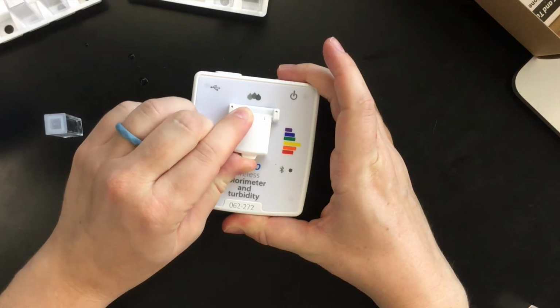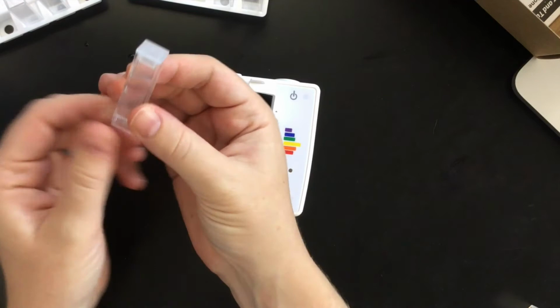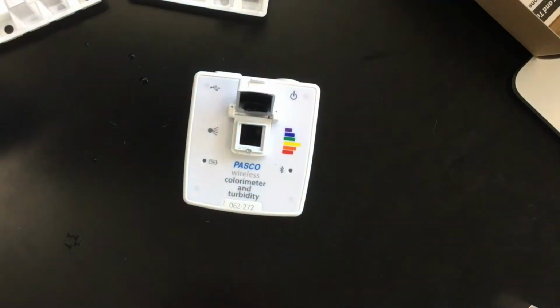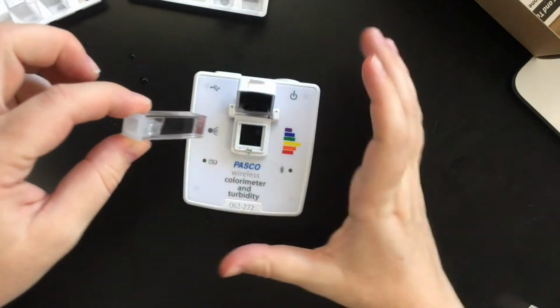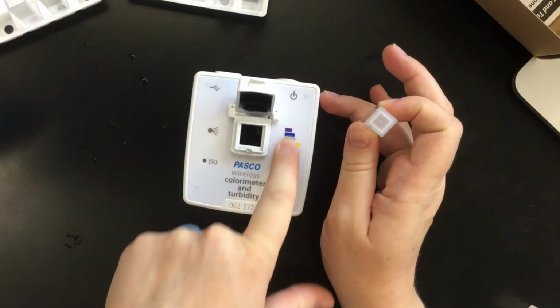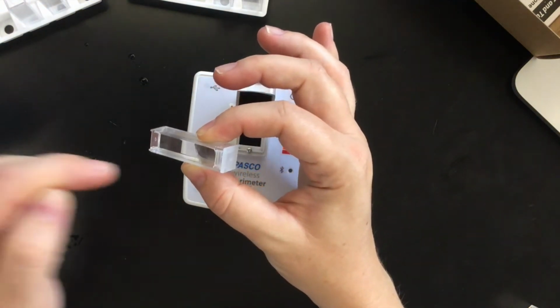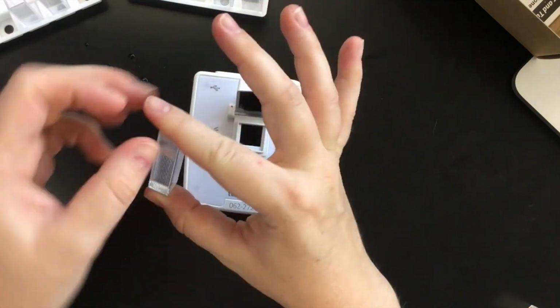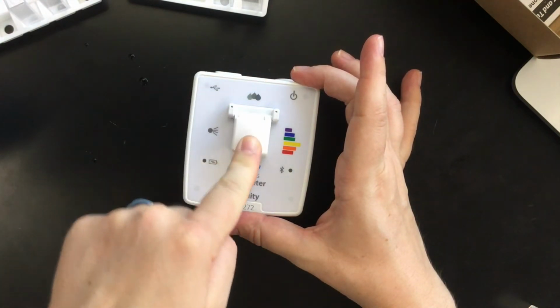So you open up the lid like that. There are two sides to the cuvette. There's this wavy side that feels textured, and then there is the kind of clear side. So you want to hold it by the wavy sides, the textured sides, but you're going to want to put it in so that this light bulb here and the colors on the side over here line up with the clear side so that light can go directly through and be unencumbered by the textured side. So you put that in, I'll press it down, and then you close the lid.